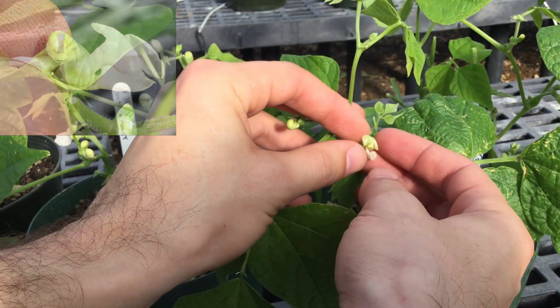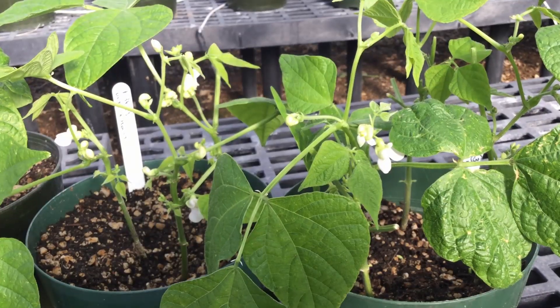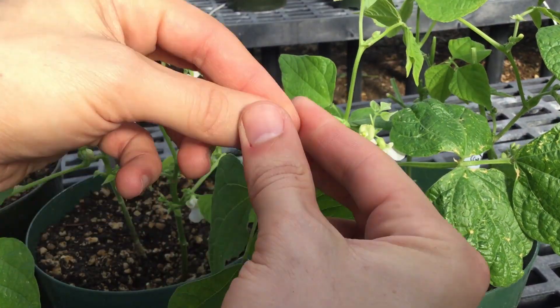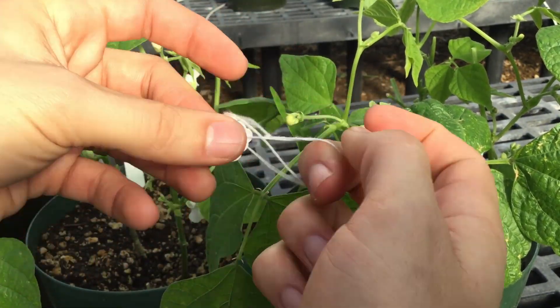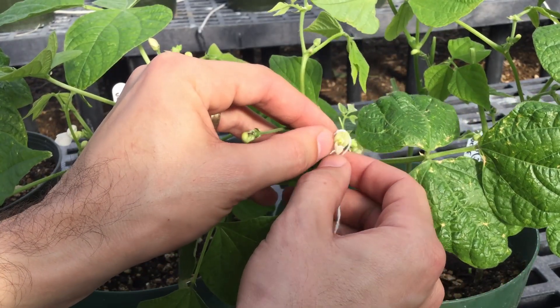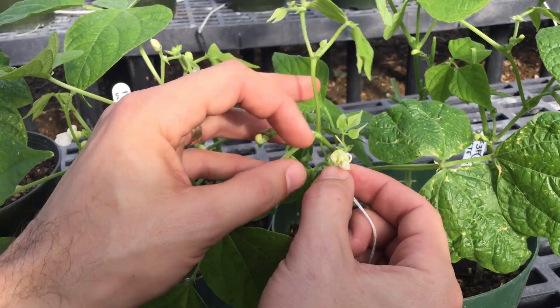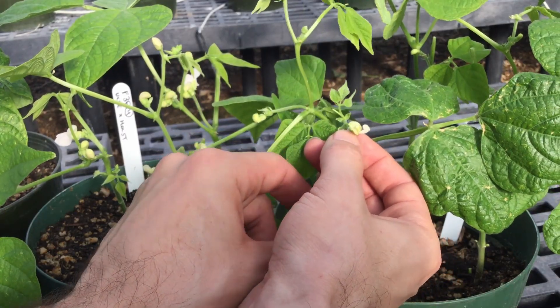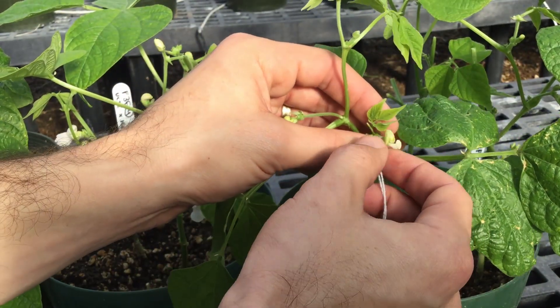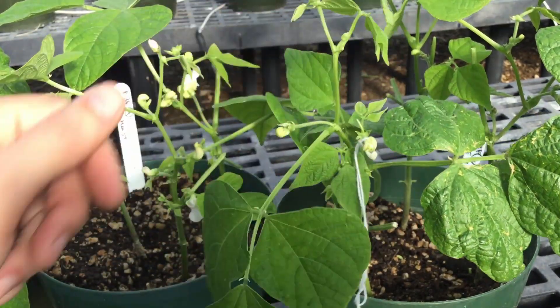It can be useful to use the banner to kind of cover it up a little bit again — probably not going to hurt anything. Then we want to take a label like this, make a loop with it, and hook it onto this flower. So now we've made our first cross. It can also be useful to remove any other flowers — we don't want any other flowers competing with the cross-pollination we just made for resources, so we just want to pull any surrounding flowers off.